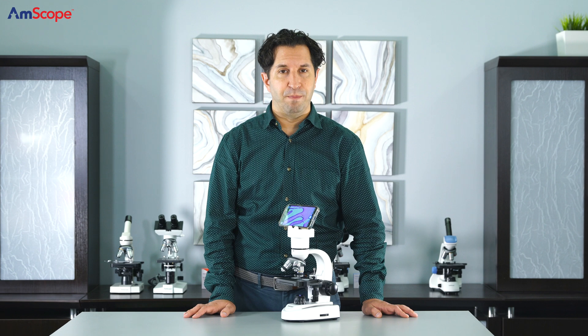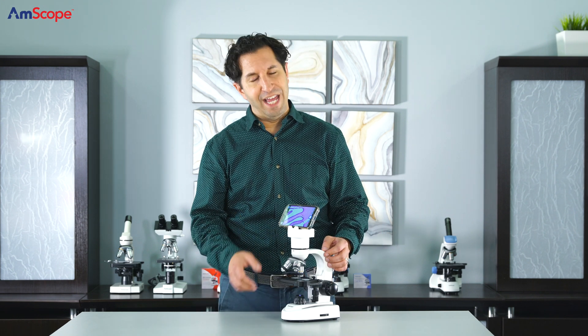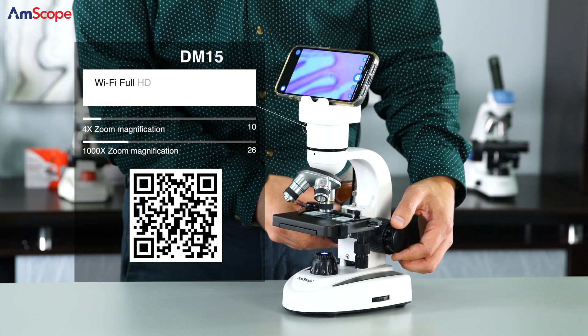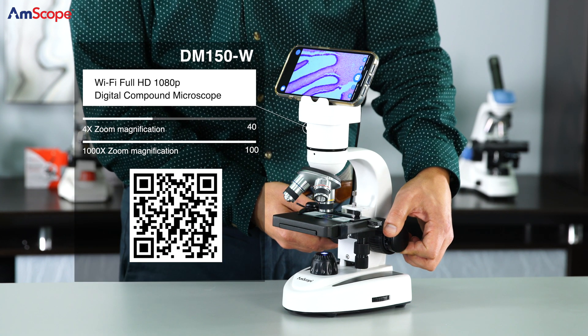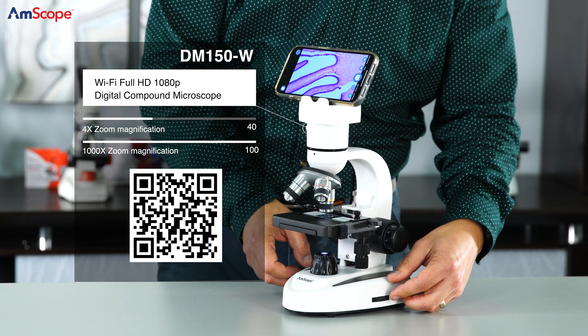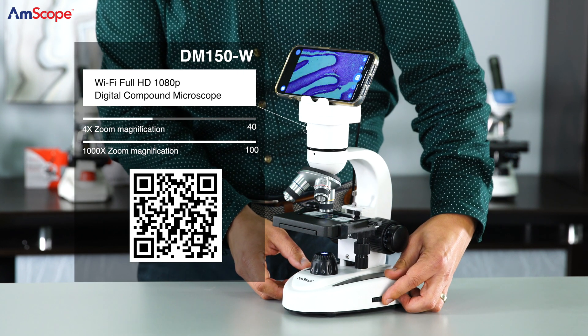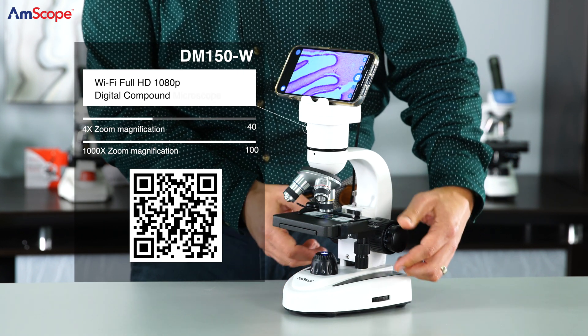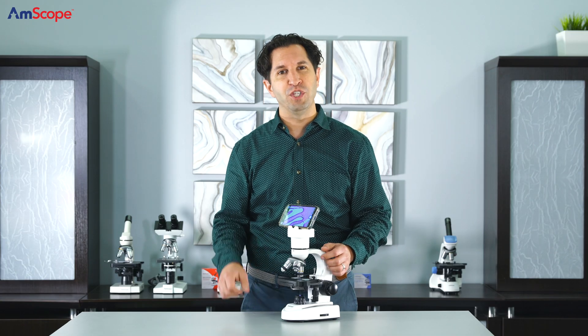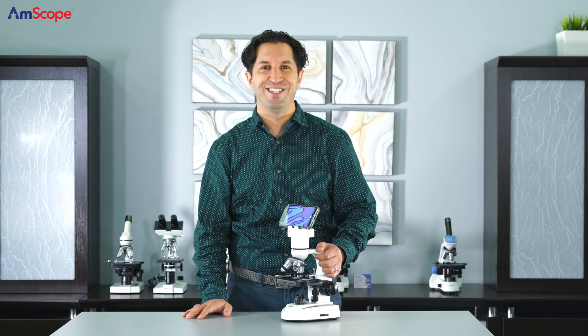The use of digital cameras and microscopy has made this useful tool even more accessible. The DM150-W streams live images and video over WiFi directly to your smartphone, tablet, or even television. The use of ultraviolet light has largely been attributed with disinfecting surfaces in a safe and effective way — have your students test this theory live and on screen, sharing their findings with the entire class.